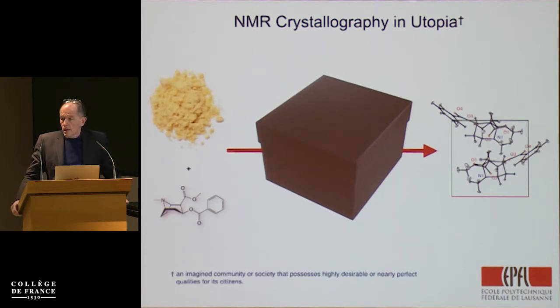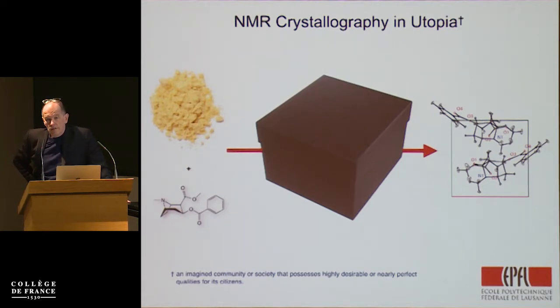And my talk is going to be based around a concept of crystallography, what we call NMR crystallography, in analogy to X-ray crystallography. And the idea, of course, is that we're going to apply it to things that aren't really crystals. Crystallography has kind of come in chemistry to mean structure determination. So we tend to talk about crystallography when we determine structures. The really interesting thing to do today is to determine structures of things that are not crystalline, or which are composite or multi-scale. And I'll try and show you that solid-state NMR is probably the best technique to look at atomic level structures of multi-scale objects.